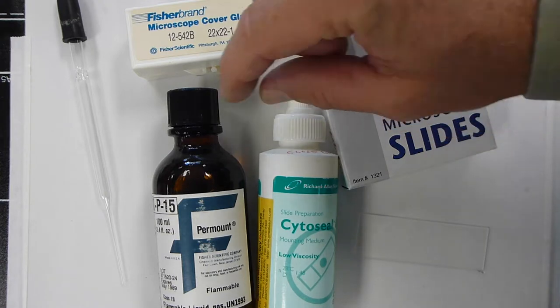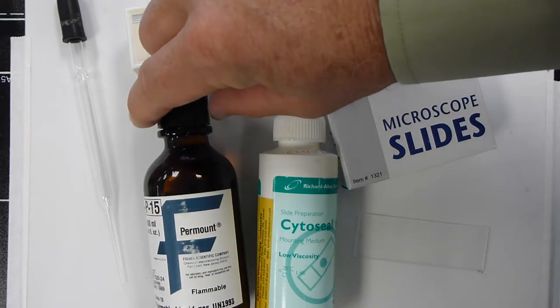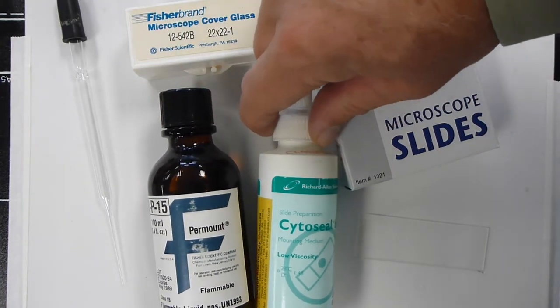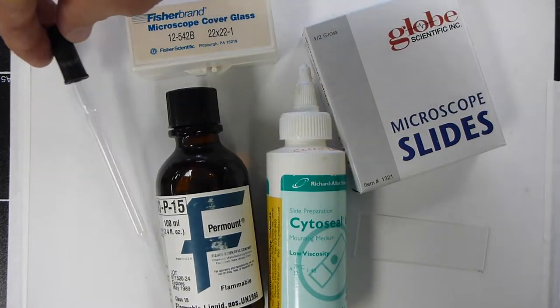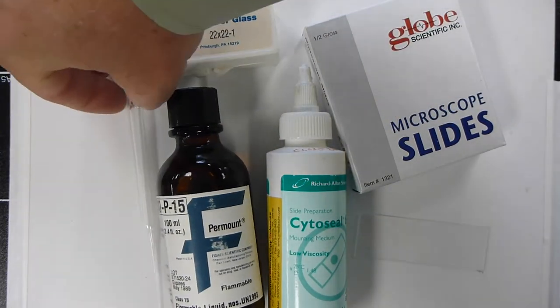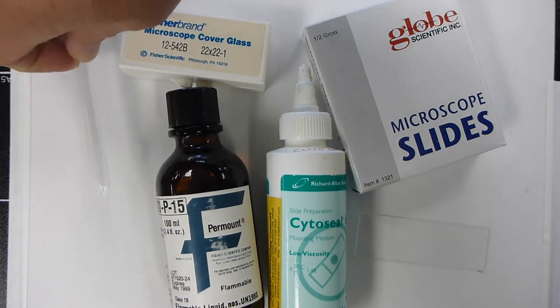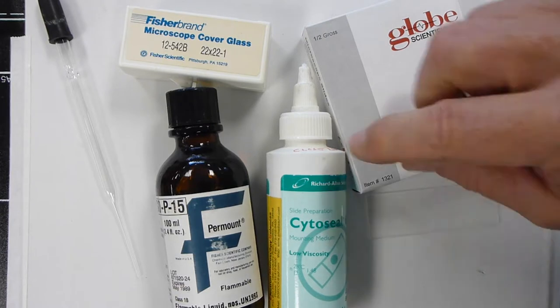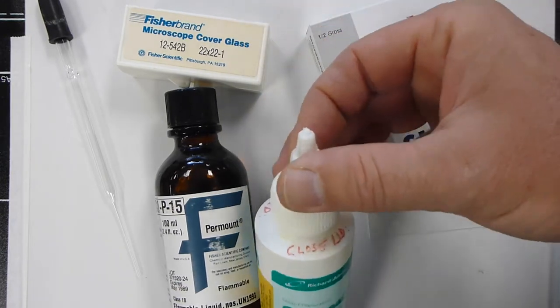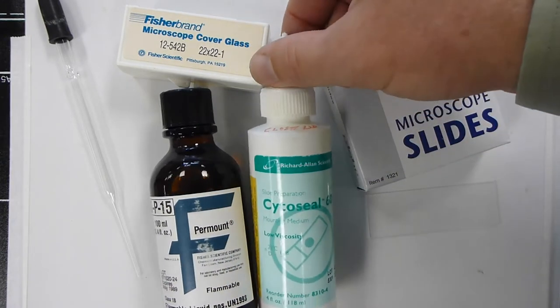And you'll need some mounting medium. We either use Permount in the lab or we use material called Cytoseal. If you use Permount, you'll need to use an eyedropper that will be disposed of immediately upon use in the sharps jar. If you use the Cytoseal, there's a little spigot on the top, which is a little bit cleaner.